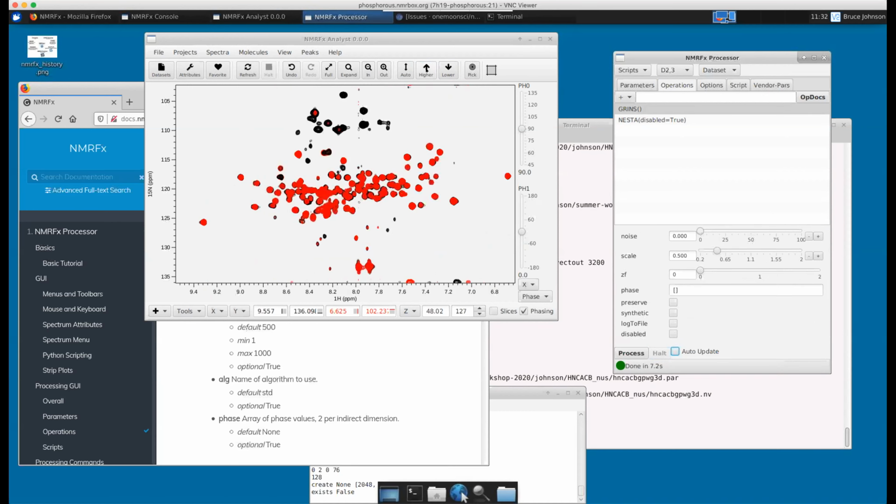And looks pretty good as well. Like I say, you really have to go in and measure intensities and do slices and look at noise to really evaluate which one is working better. Just from this casual look, maybe there's more of a streak through from the GRINS. I should also say there are multiple options and parameters that you can play around with to optimize. But basically, it's that simple to go.